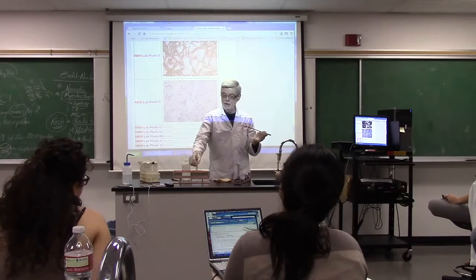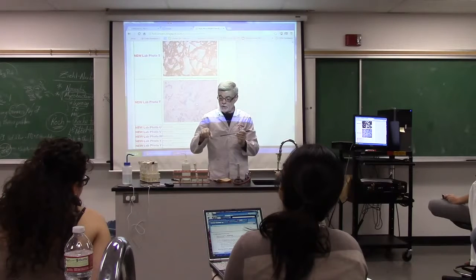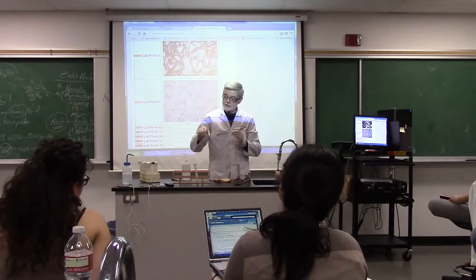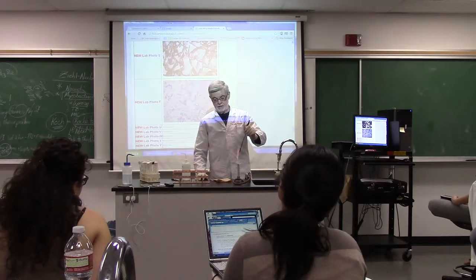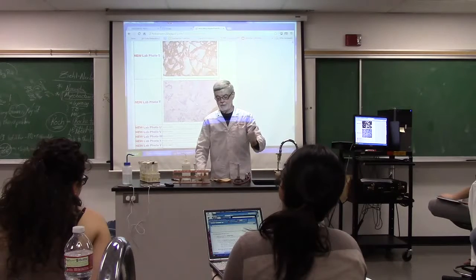Don't grab the agar. And then when you put it in the water, it's going to come off in clumps, so you're basically going to have to bang it. Just bang those clumps till they fall apart. Once they fall apart, then you can spread it over the rest of the slide. But remember to get the clumps in the circle. And you can actually stroke them into the circle so that you make sure you have your mycobacterium in the circle. Then heat this to red hot to kill everything that might be on it. And that's really important because this mycobacterium is hard to kill.